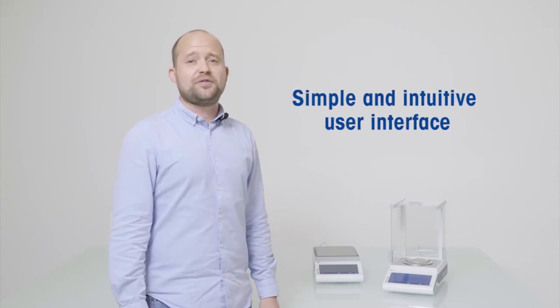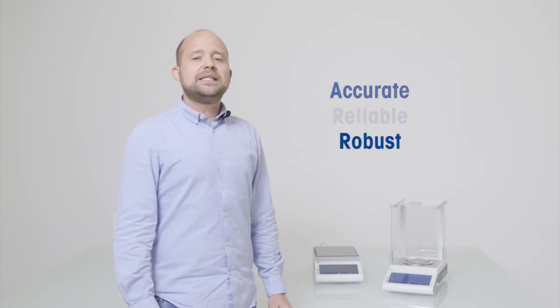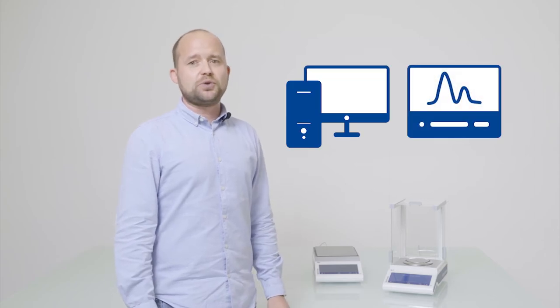These balances are characterized by their simple and intuitive user interface. In addition to reliable and accurate weighing performance and a robust mechanical housing, these balances feature various built-in weighing applications and connectivity functions for connecting to PC or other laboratory instruments. So let's discover all these features together and get a closer look at them.